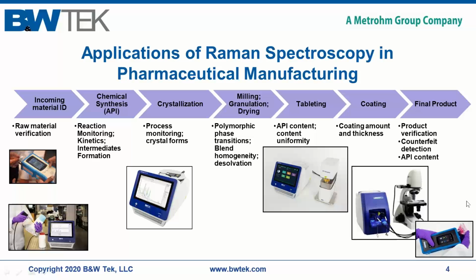Okay, great, thank you. Is there a sample holder to measure multiple tablets at once? This instrument, as it is now, is a single tablet holder, but developments into multi-tablet holders are in the works as well for the future. But at this time, this is a dedicated single tablet measurement system. Yes. Lovely. What is the criterion for selection of the best SEP and SEC value? What is the criterion?